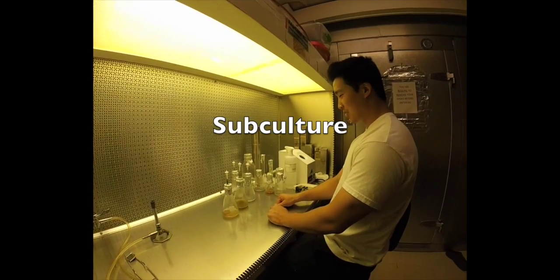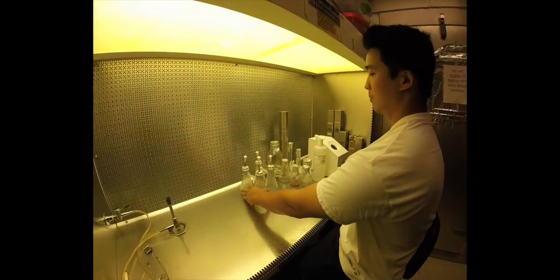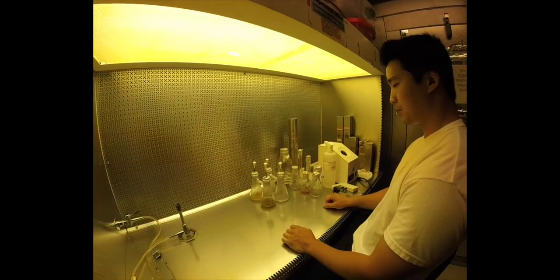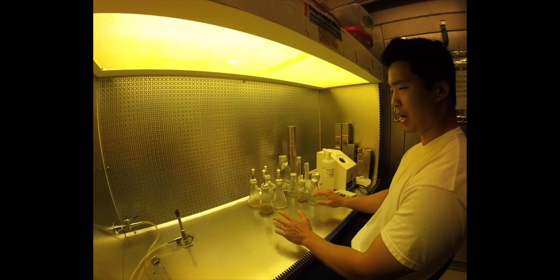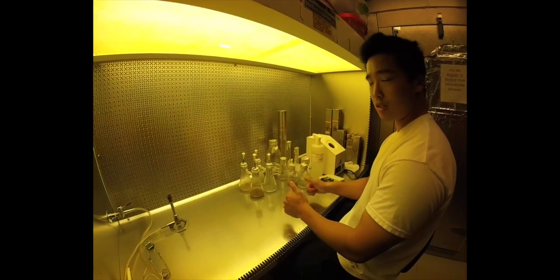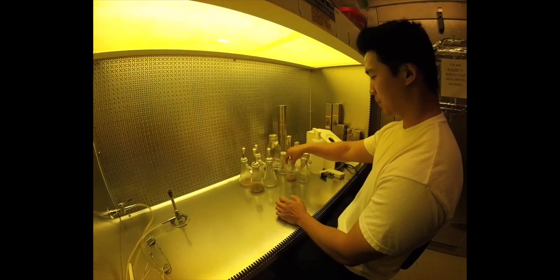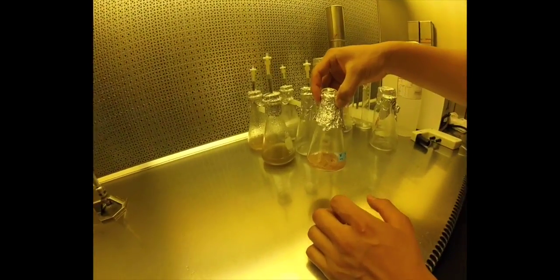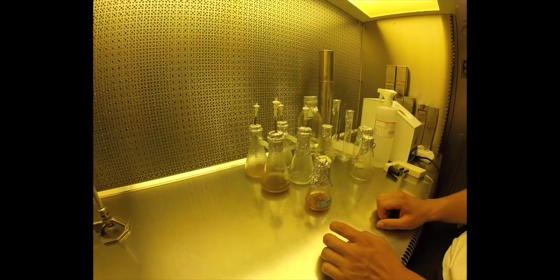Welcome back. So we are in the plant hood right now in room 230, and the reason why I use this hood is because I'm certain that this culture is axenic, and we're doing work with some of the roots. This is a pretty reliable area, but you do need permission from the plant people, algae guys and girls. Everything's set up now. We are using Nicotiana benthamiana cultures as the roots for this symbiotic culturing we're doing here, and so it might be a good idea to have one of these lines being maintained as well, just so you don't have to bother the plant people.